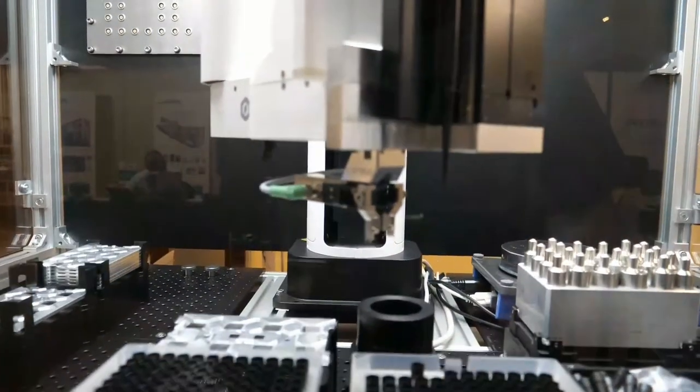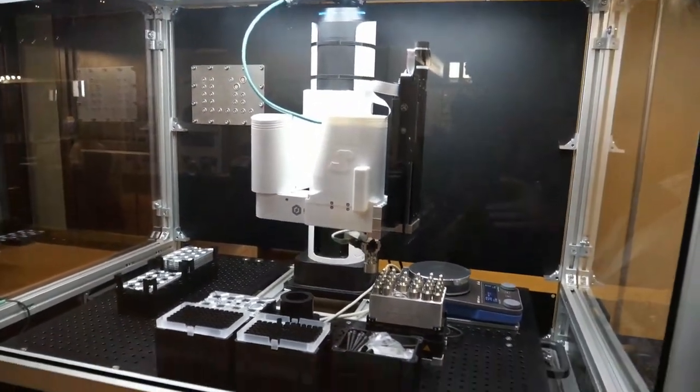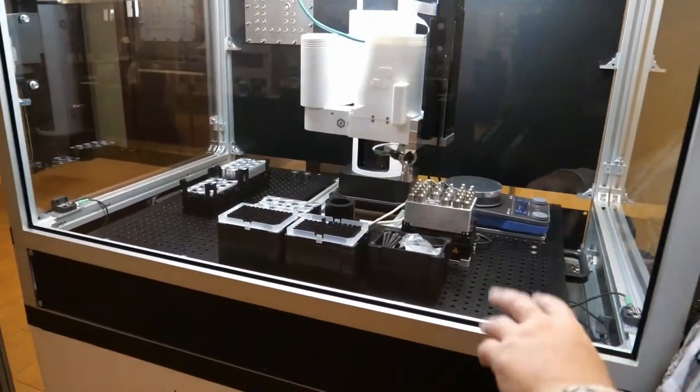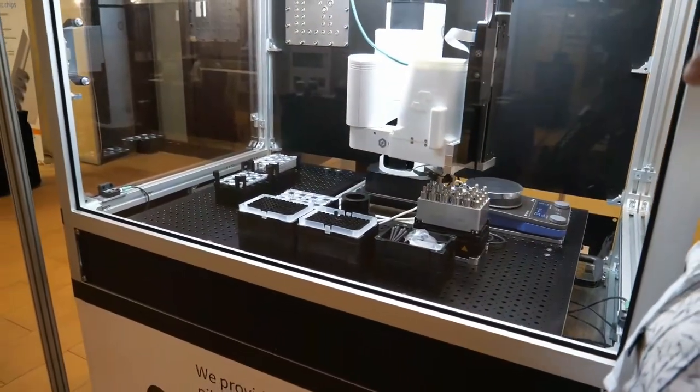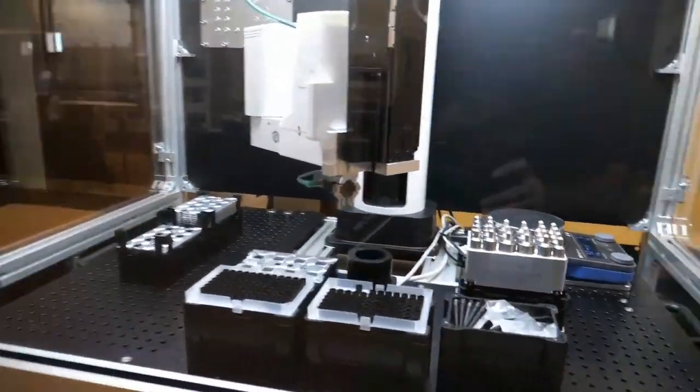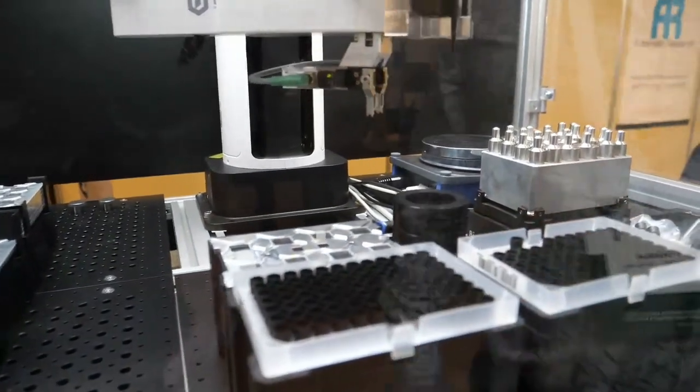So what is it doing right now? It just took the tip, now it opens the vial to take the ink. It goes down, detects where the ink starts, takes the ink, puts the lid back so that it doesn't evaporate, and now it will eject the ink on the spin-coder.